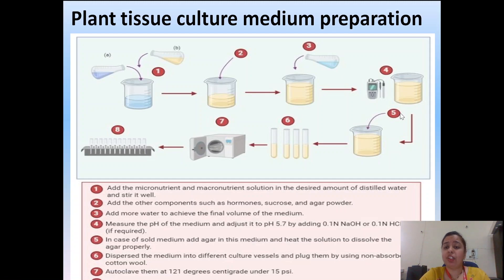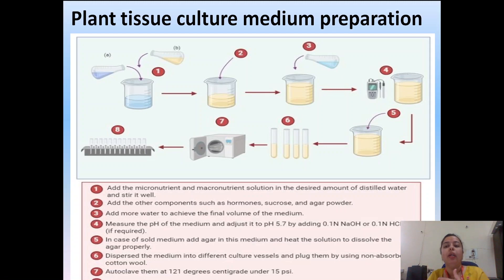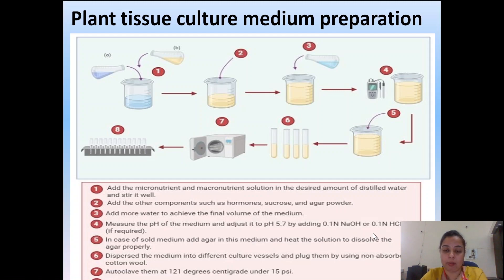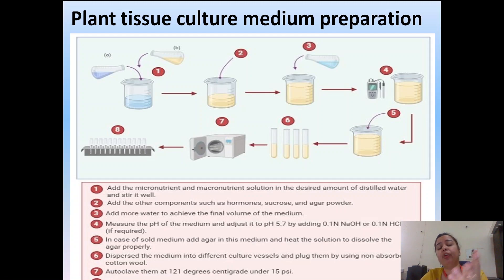Then the pH is adjusted. According to the explant or the plant, the pH requirement of each plant is different — this is a crucial step. We adjust it using 0.1 normal NaOH or 0.1 normal HCl. If we need to basify the medium we use 0.1 normal NaOH; if we want to acidify, we use 0.1 normal HCl.